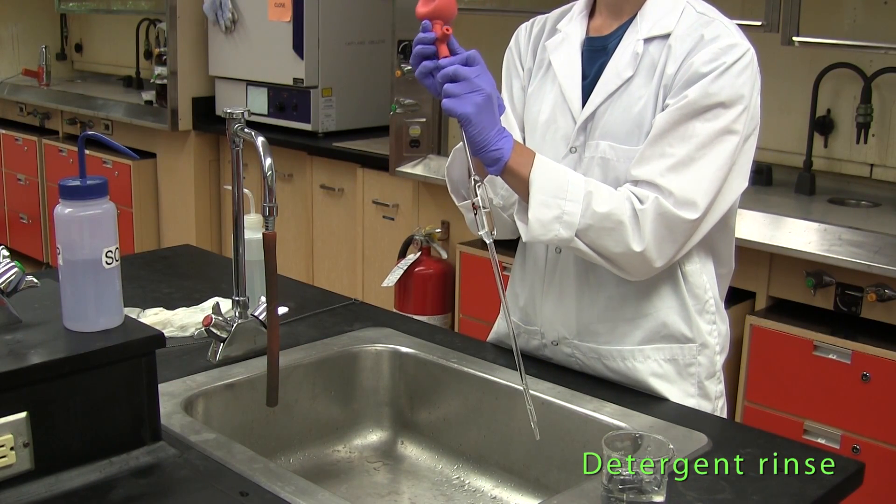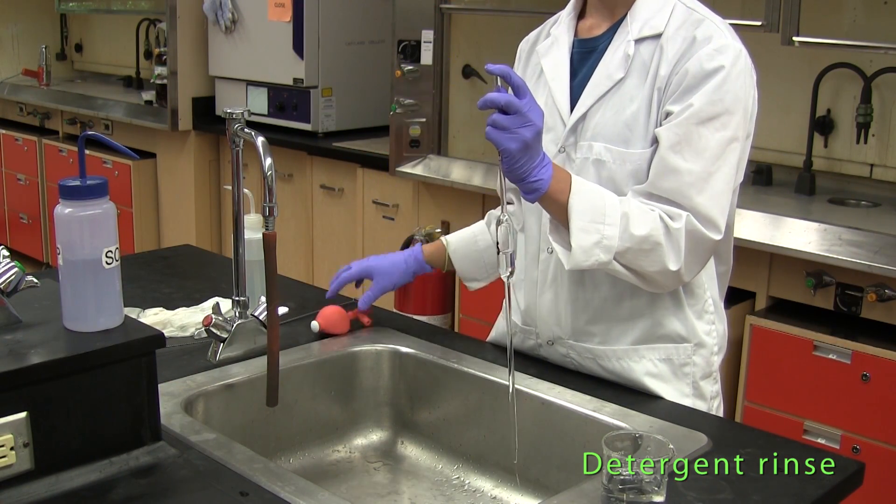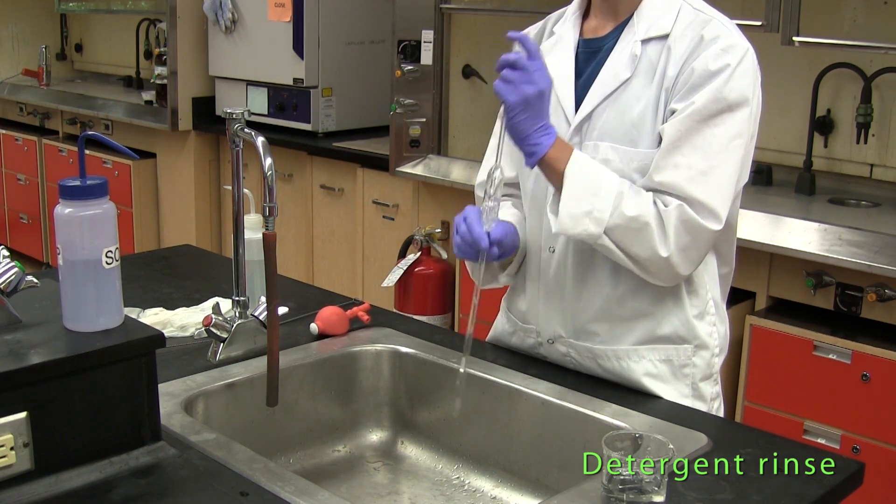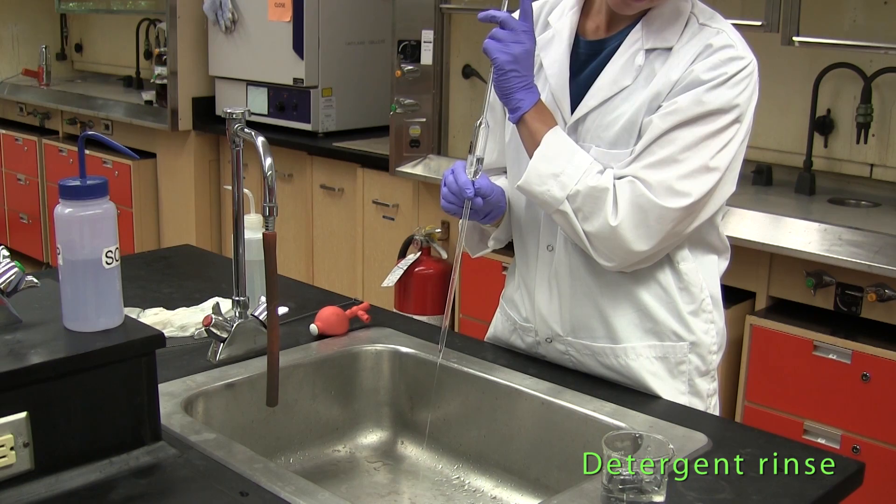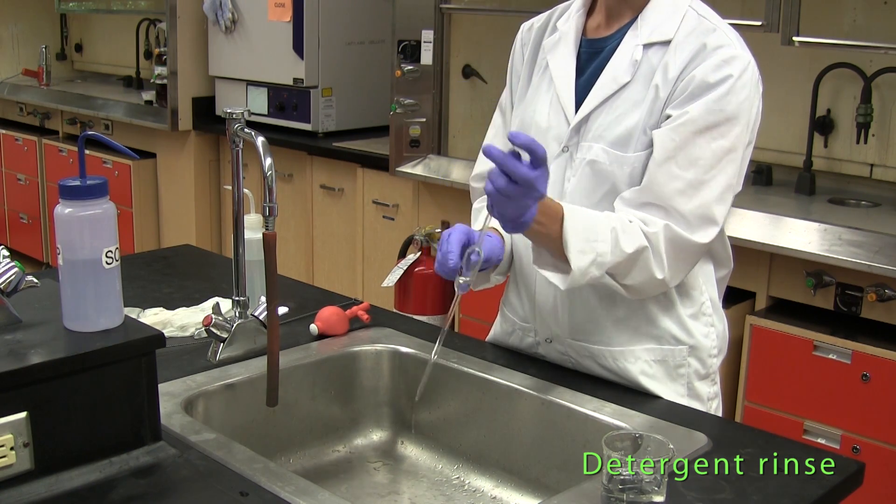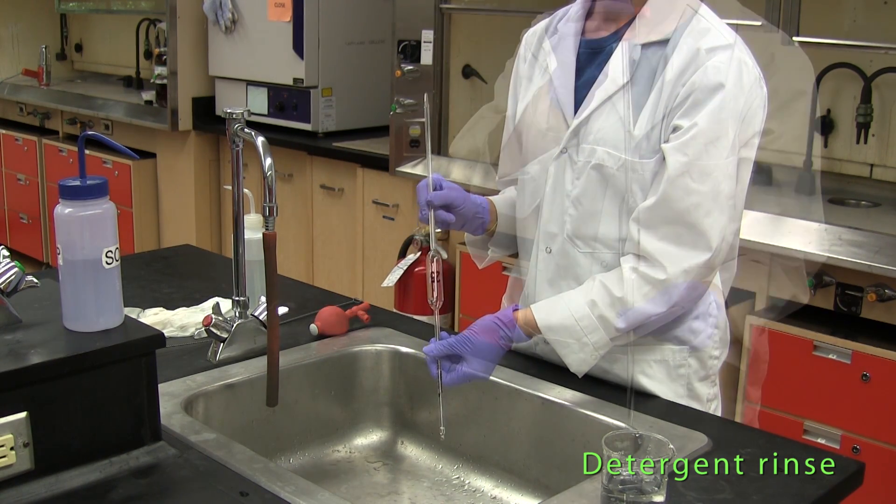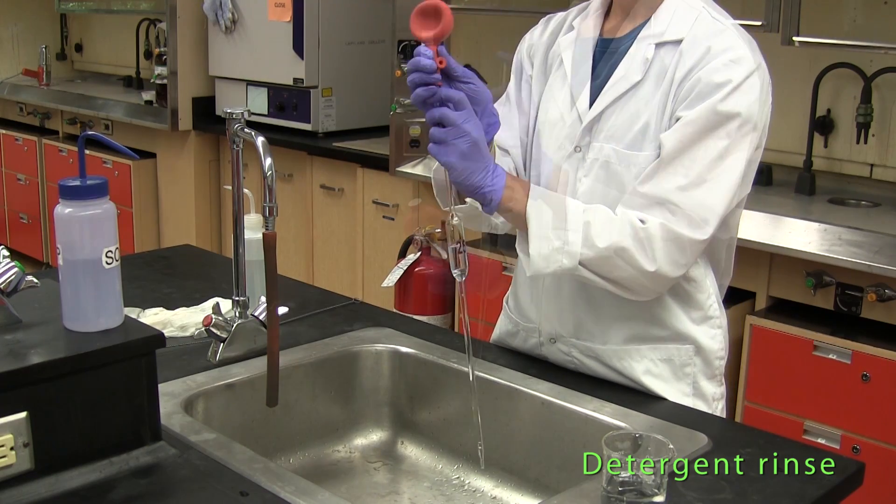The pipette filler is removed and an index finger is placed on the upper end of the pipette to prevent the liquid from running out. The pipette is shaken several times and the detergent solution is discarded. The procedure is repeated once or twice.